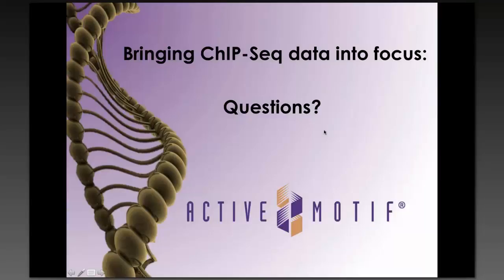They wanted to get your read on a suggestion. If you deduplicated sequencing reads, this might also help remove PCR overamplifications. Do you have any thoughts on how that might work? Yeah, so that's standard practice for us. We always eliminate duplicates in our ChIP data analysis. In a good experiment, we may throw out 1 million reads, and in an experiment that's not so great, we could be throwing out 15 million because they're duplicates. In this case, duplicates were removed from both the human mapping and the Drosophila mapping.